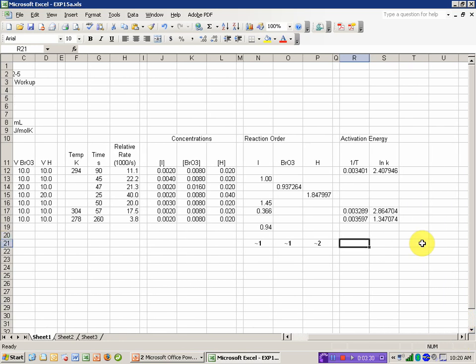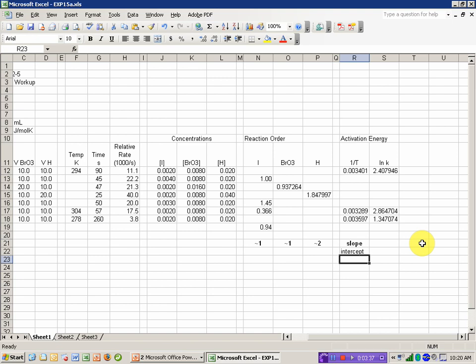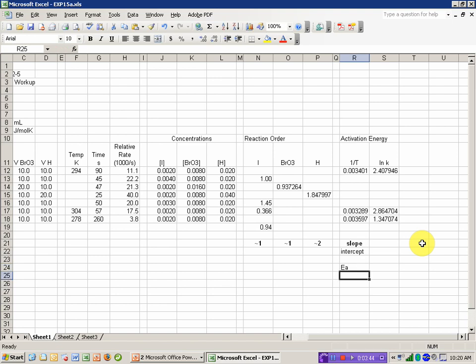And coming over here, I can do a little bit of labeling here. I'm going to calculate a slope, an intercept. I'm then going to calculate my activation energy. The units that this is going to come out in are joules per mole.